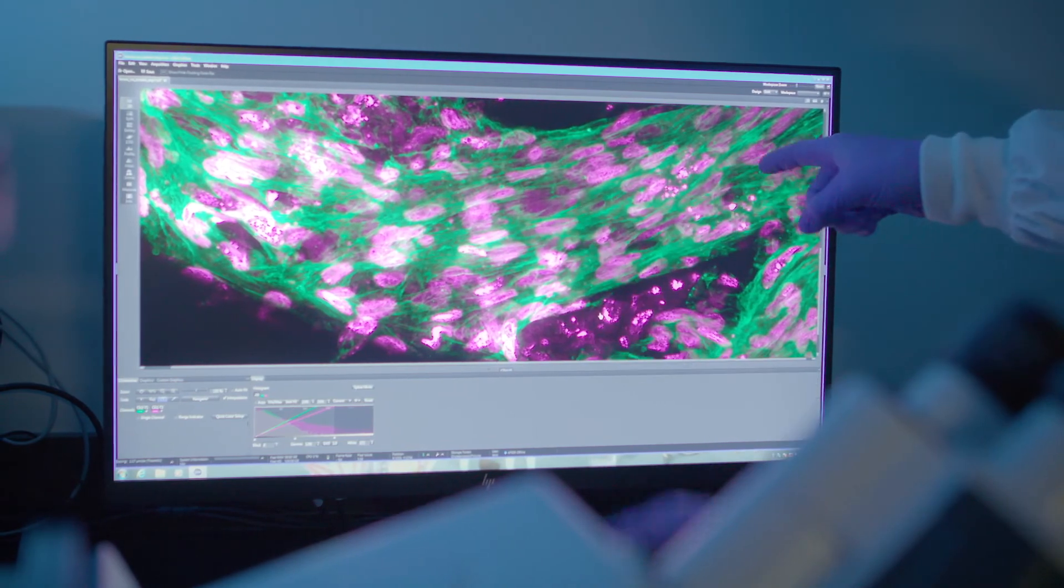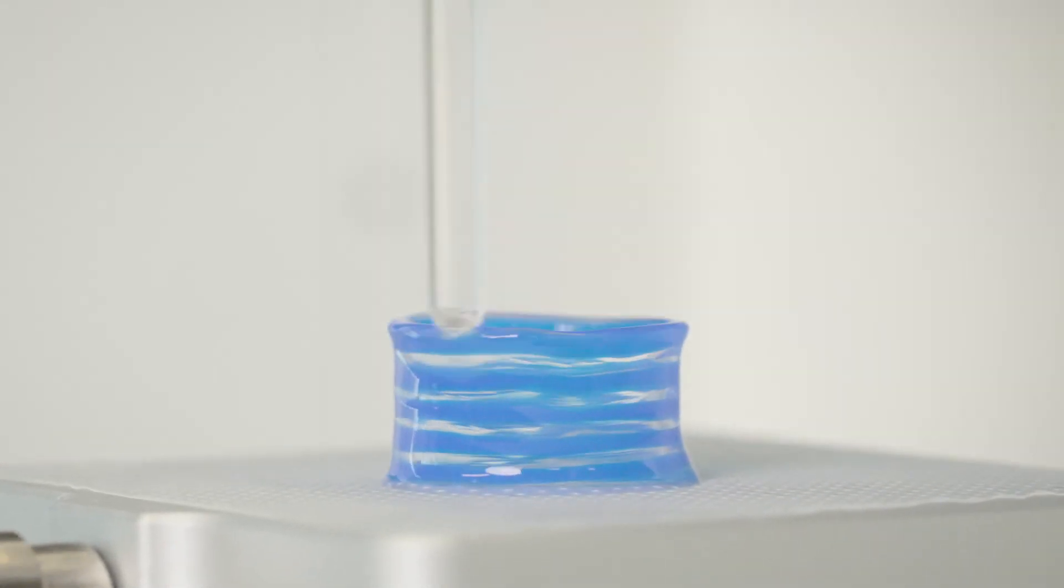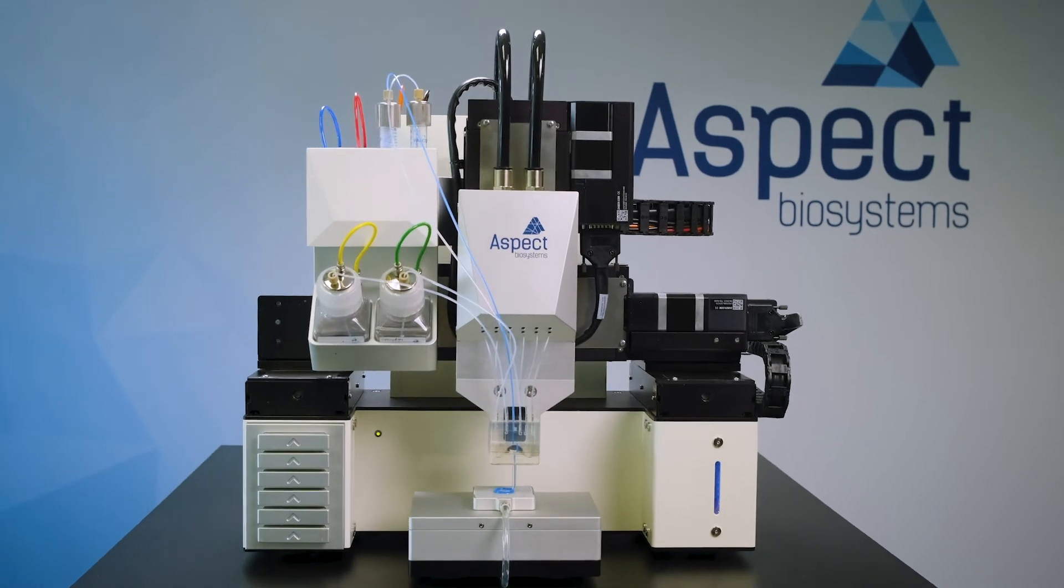By combining microfluidics and 3D bioprinting, Aspect technology provides the control and flexibility to print complex functional tissue for therapeutic discovery and regenerative medicine.